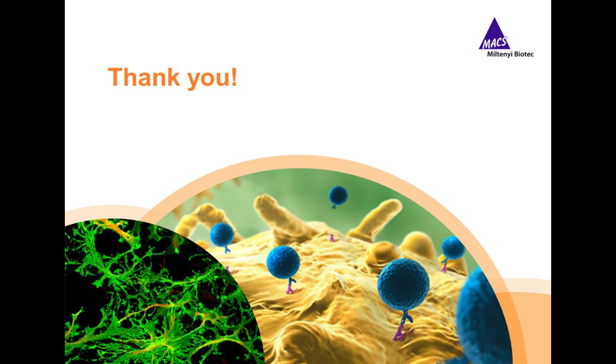The advantage of the GLAST antibody is that you can combine it with intracellular markers better than ACSA-2, because ACSA-2 is sensitive to detergents. It cannot be nicely stained anymore when the cells were treated with detergents, and then the GLAST antibody is preferred, as the GLAST staining is not affected by detergents. But both can be used for neonatal and adult mouse brain for staining of astrocytes. If you want to detect astrocytes in rat and human brain, you have to use the anti-GLAST antibody, as the anti-ACSA-2 antibody is not cross-reactive.